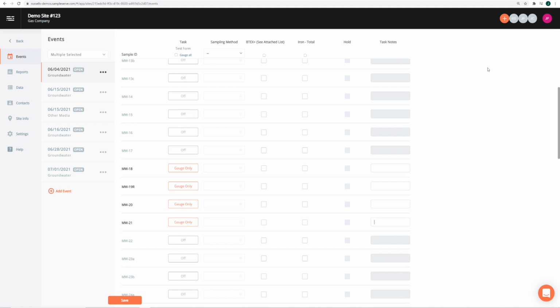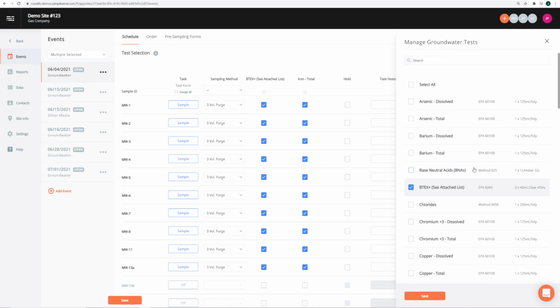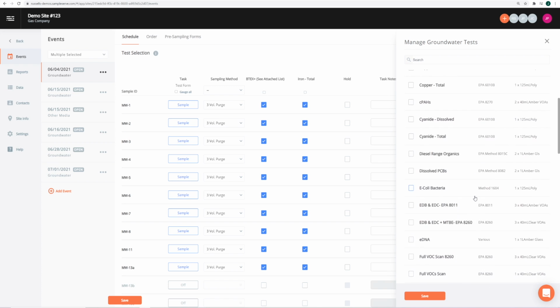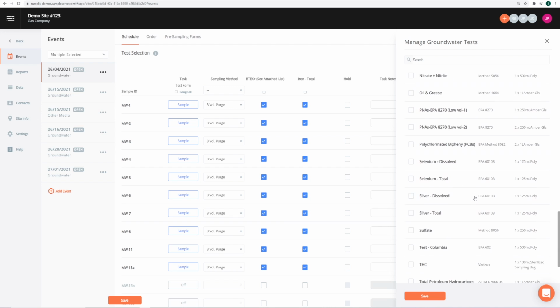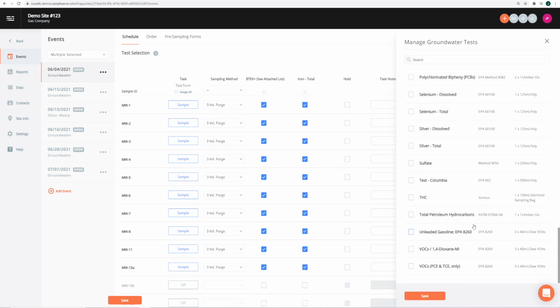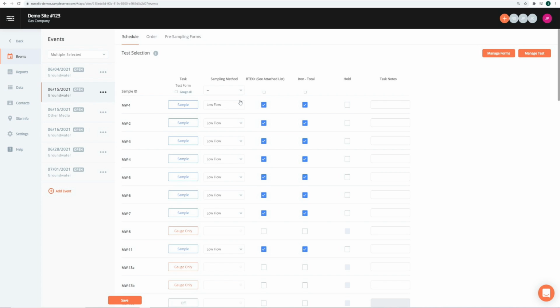A new lab that hasn't been set up in the SampleServe platform by the selected lab will be populated with a standard set of default analytical parameters. If the analytical tests you need are not populated yet by the selected lab, let your SampleServe contact know, and we can set those needed analytical parameters up for the new lab within minutes. The new lab can also log into their account on our platform and populate their analytical parameter menu themselves as well.